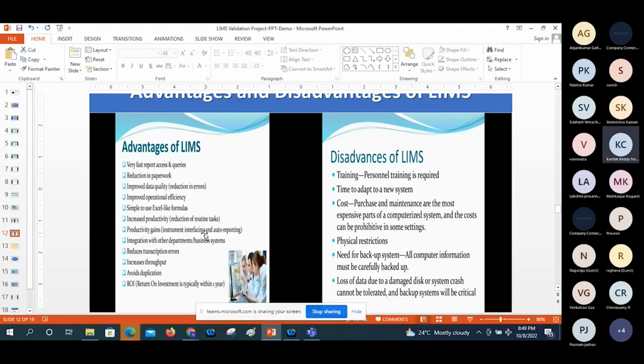Errors should not happen in whatever we do. For example, say I am the analyst and I made some falsified data entry in the system and saved it without checking. After that, the reviewer finds those mistakes. Whatever the analyst performed can be tracked in the system, so the reviewer can revert it to the analyst, and the analyst can perform the result entry properly.